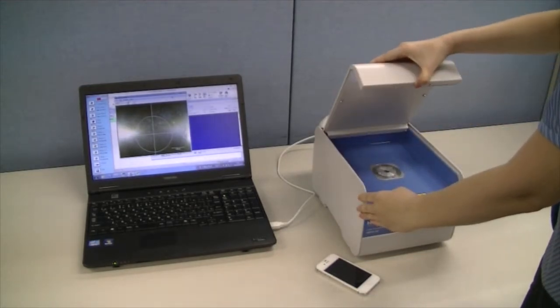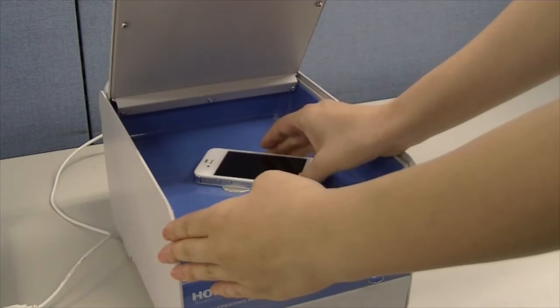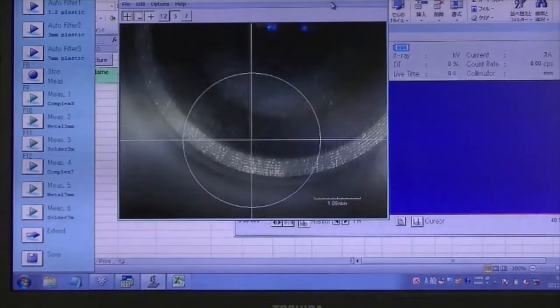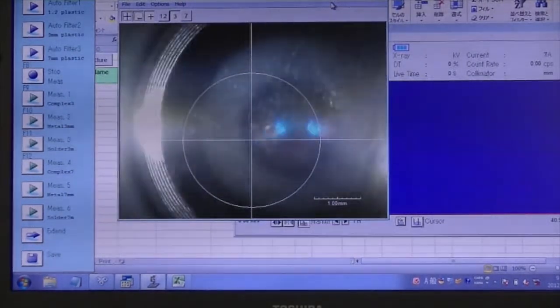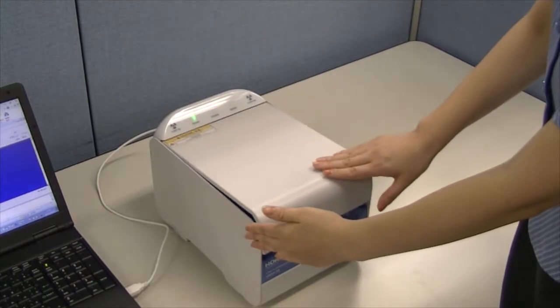It's time to make an actual measurement. Open the lid, place your sample on the stage. You can confirm on the PC screen whether your sample is in the right place or not. Close the lid when the sample is set.